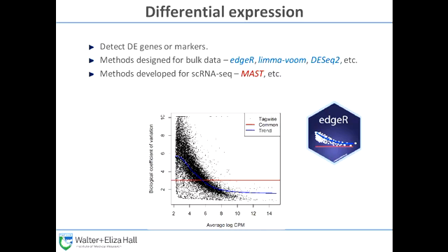That's subtly different from another common problem in single-cell RNA-seq data, where we do a clustering, and then we want to say, what are the marker genes that most strongly distinguish this cluster from that cluster from this other cluster? In that case, that's not a designed experiment anymore. You've learnt those clusters from the data. So you have to be very careful with interpreting a statistical test, because you're basically breaking the assumptions of these tests.